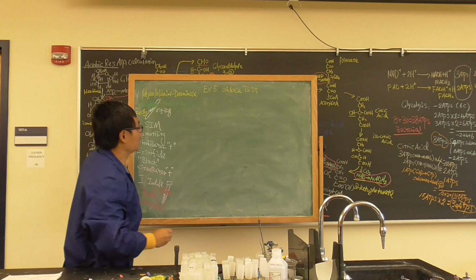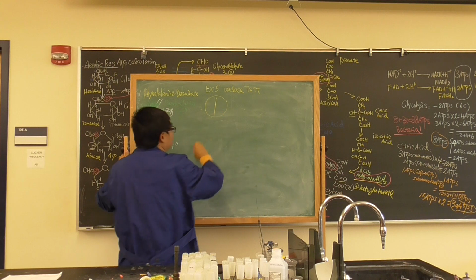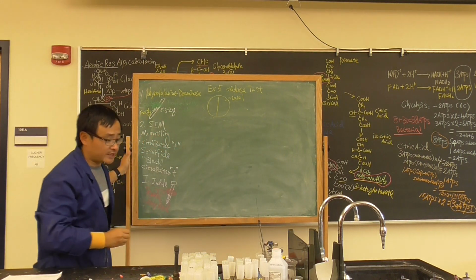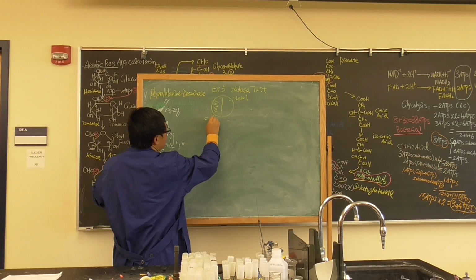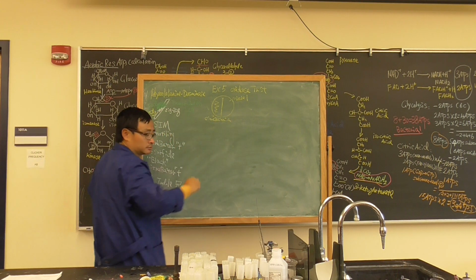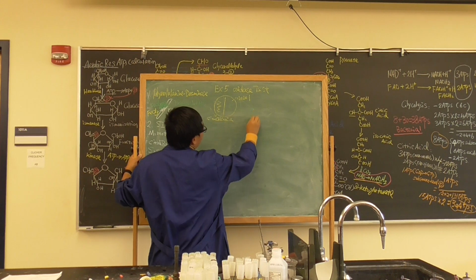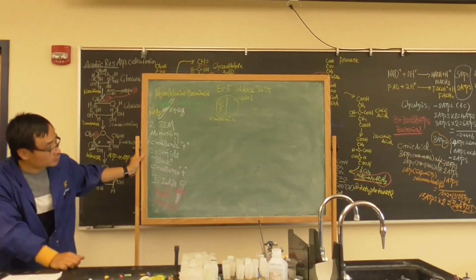Okay, the oxidase test is very simple. You have a nutrient agar. Split it into 2. Of course, you have to label at the back, okay? On the left side, please do a streak inoculation of Citrobacter. On the right side, do a streak inoculation of whatever you like. You can do E. coli, Bacillus, Lactobacillus, whatever you like. So we'll do the comparison.